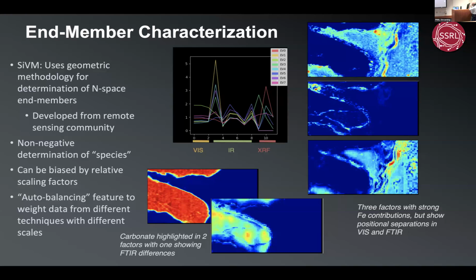And we can do this and we'll go back to that coral. I know I'm jumping between samples, but I'm kind of cherry picking the best examples of what works best for this particular example. One of my favorite things to do in chemical imaging and now this total multivariate analysis is this end member characterization. Because that's often what we care about. Not only just what's there, but what's the most different from something else, and how can I characterize those end members then to characterize everything in the sample.